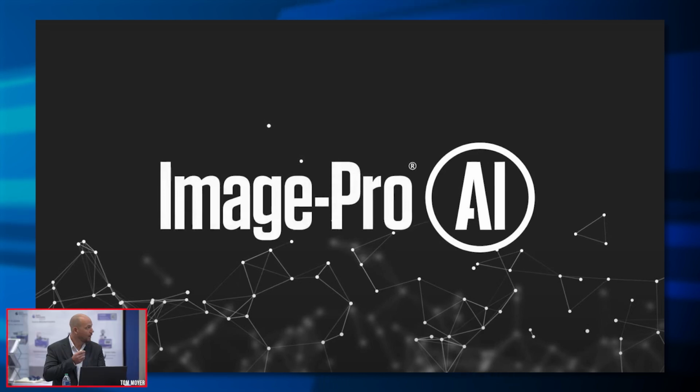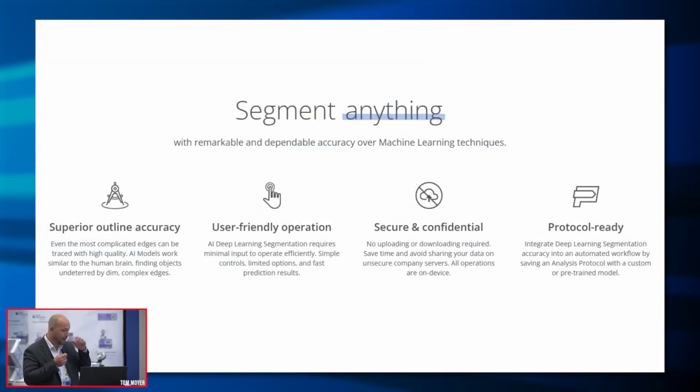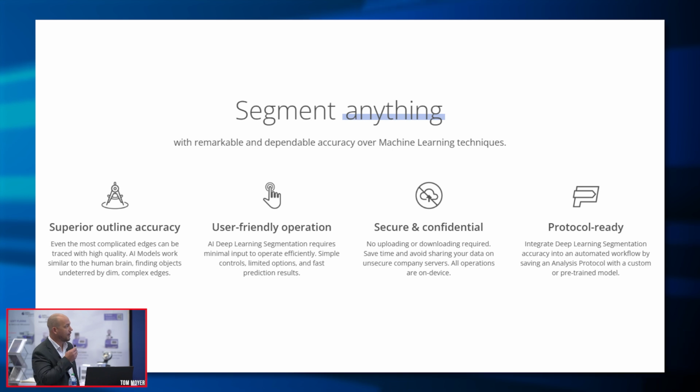Thank you, Jeff. And thank you, everyone, for joining us to learn a little bit more about our latest version, ImagePro AI. I hope that we have demonstrated our integration of AI deep learning to tackle complex image analysis and segmentation. Again, we have increased accuracy with AI deep learning models, and I feel that we have implemented this in a very user-friendly way.